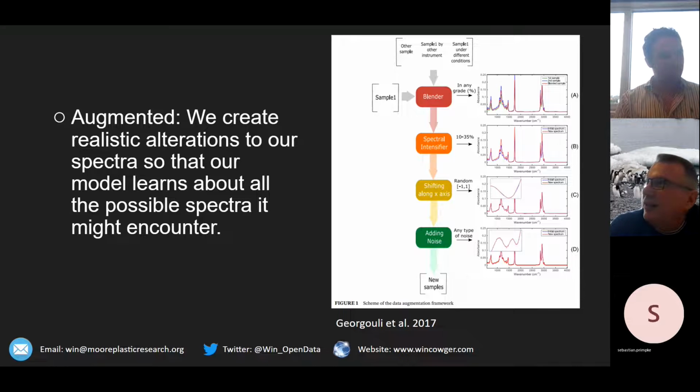So the idea is that we can do both FTIR with scanning and using siMPle and Open Specy, and at the same time run the pyrolysis on the same samples. And that's why we get slightly lousier spectra of less quality, but it seems to work relatively well, as we experienced these last couple of days. Yeah, it's the same reason we decided to use Anodisc, because we can crush them and put them into pyrolysis as well.